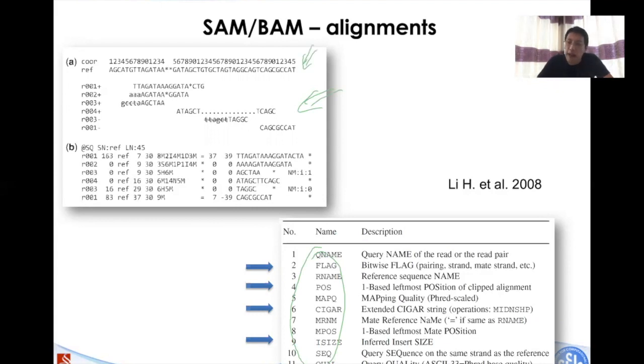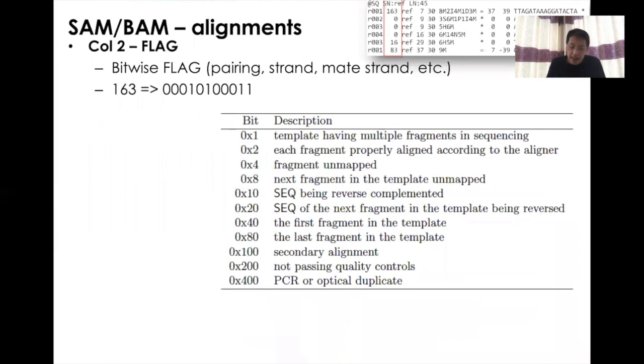The top part is the reference genomic location as well as the reference sequence. And this part is the sequencing reads, where in reality they align to. And the bottom part here is just the BAM information, recording where the sequence aligned to. So let's go through this individually. As I mentioned earlier, the first part is pretty straightforward. It's just the sequence identifier, whatever sequence identifier is reported in the FASTQ files.